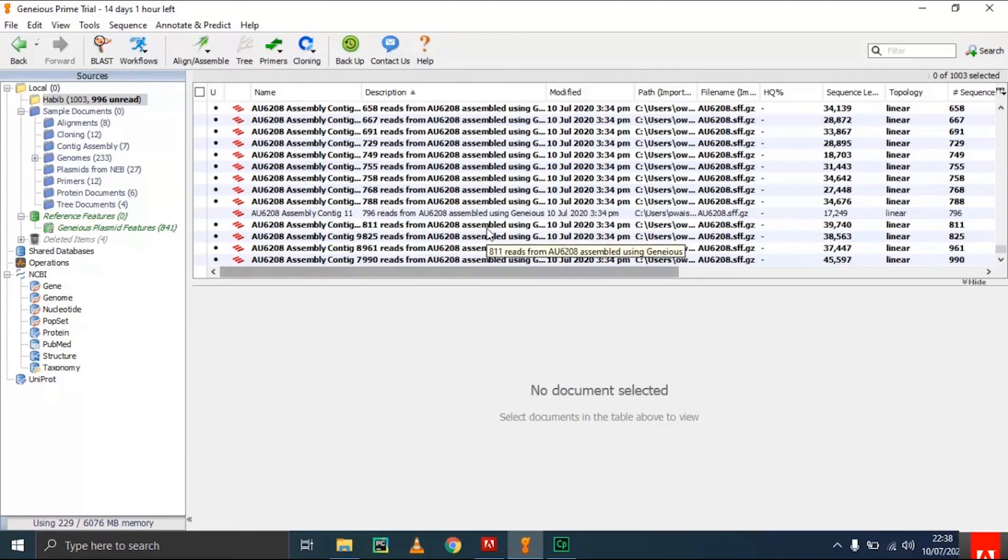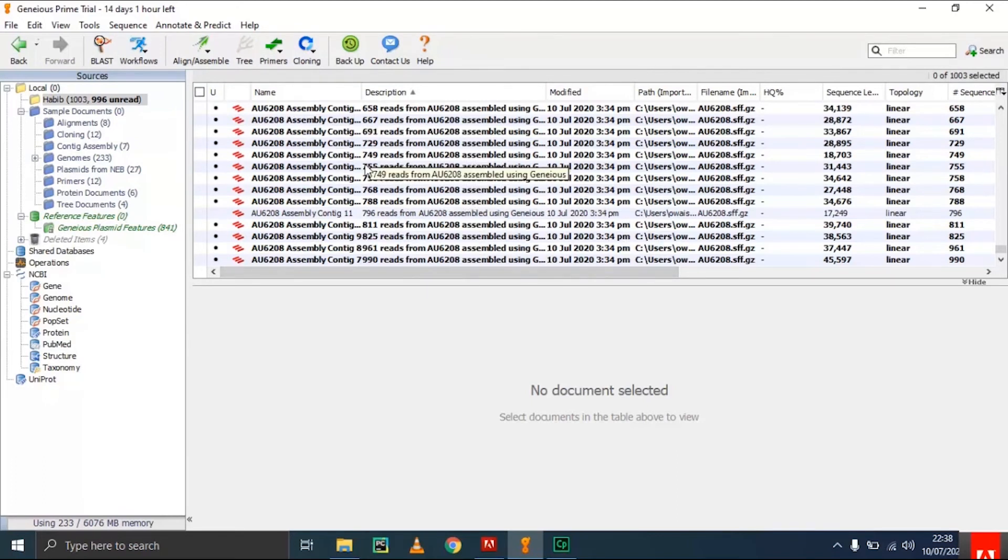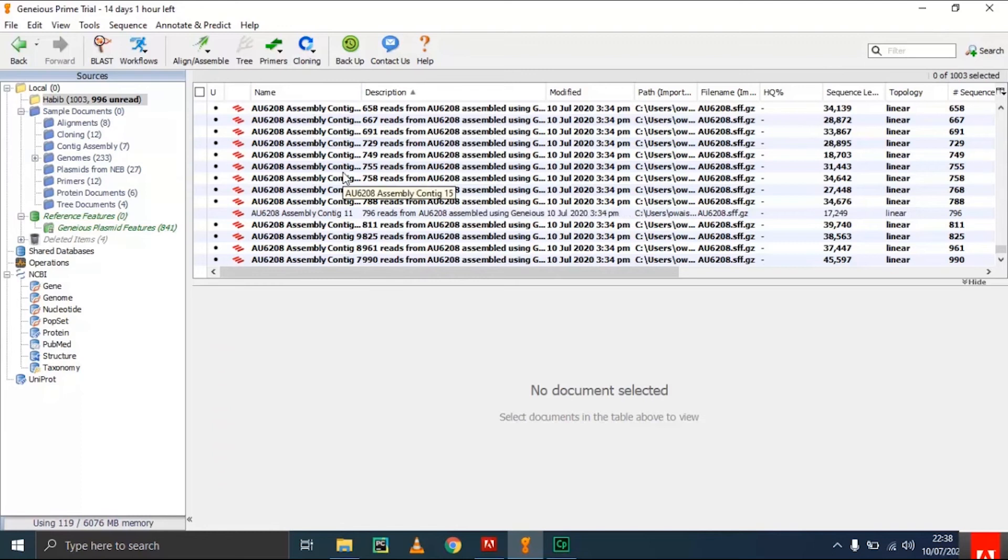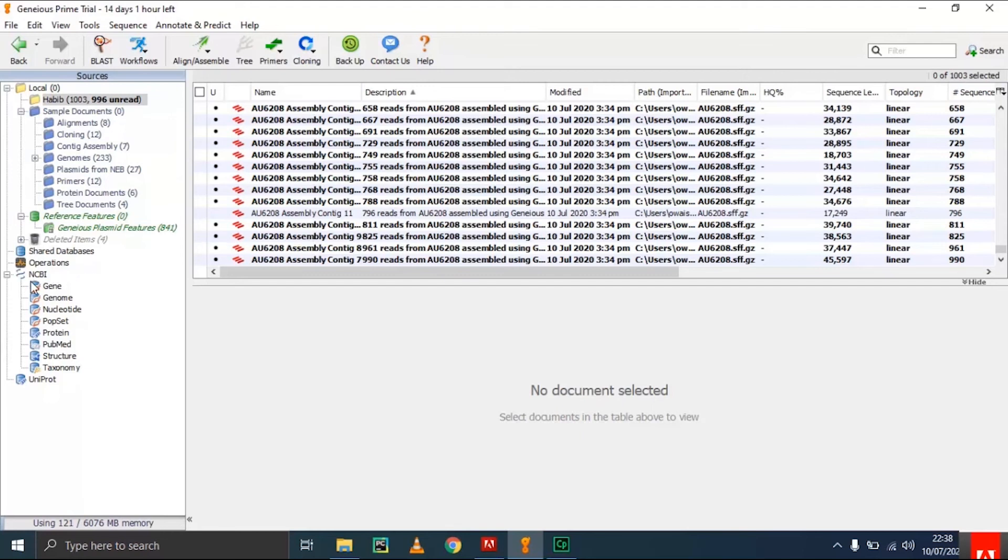Every step I did here was offline, so you don't need an internet connection to assemble your genome. You only need an internet connection to import files from the NCBI databases or UniProt for protein sequences or gene sequences. Once you have imported, it's all offline.